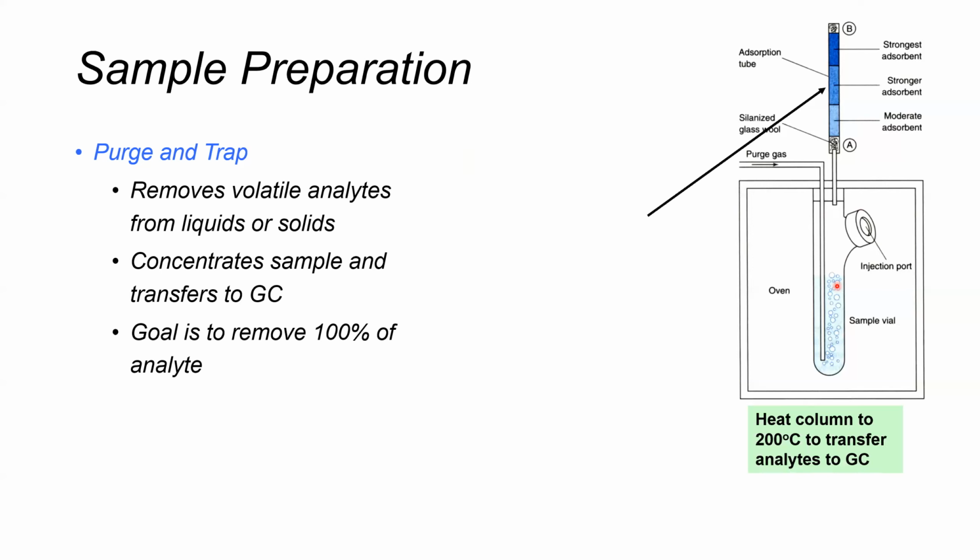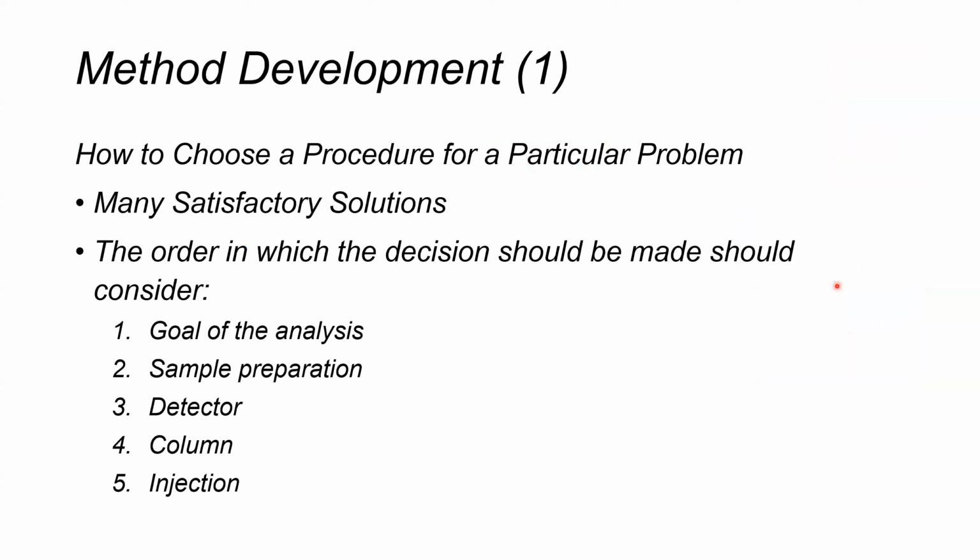And then we heat the column to 200 degrees Celsius to transfer the analytes to the gas chromatography column.